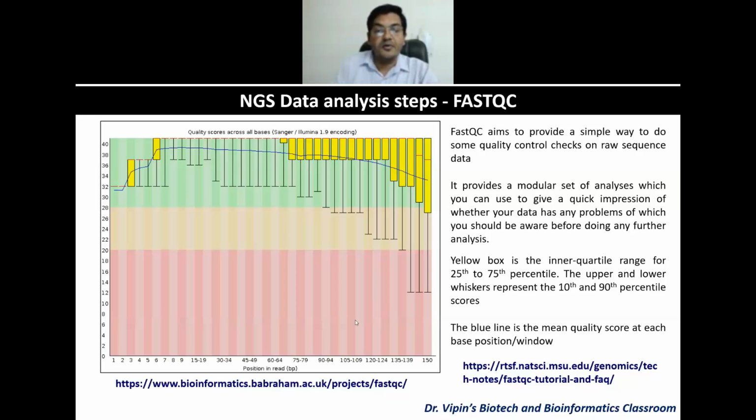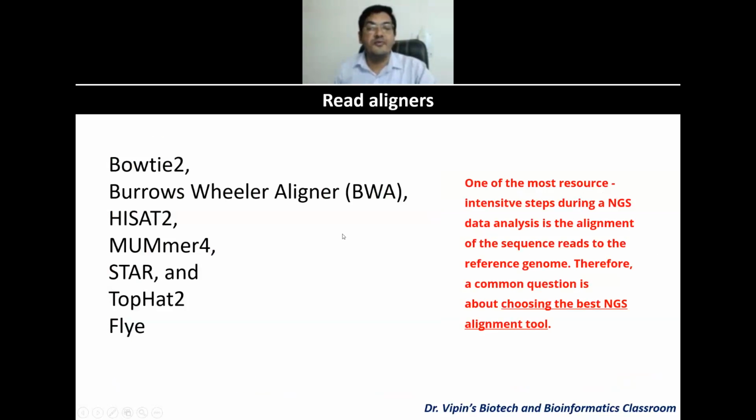Then we move on and talk more about other things. So then, as I said, once you have done your FastQC and trimmed your data, you have to align your data to a reference now, right? Or you could do a de novo assembly. Most commonly with short reads, you do a reference-based assembly.